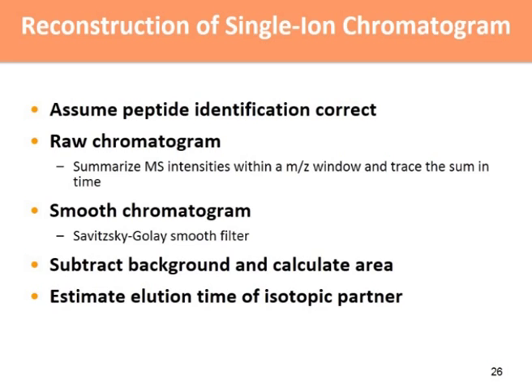And you go back to the raw chromatogram and open an m/z window, like a mass tolerance window of a certain size, and you reconstruct the chromatogram over time. This is a parameter that when you run, you can specify the size of that window. A very large window will start including maybe other isotopes or other species. A very narrow window may not have enough signal. So you sort of play with that depending on your experiment.